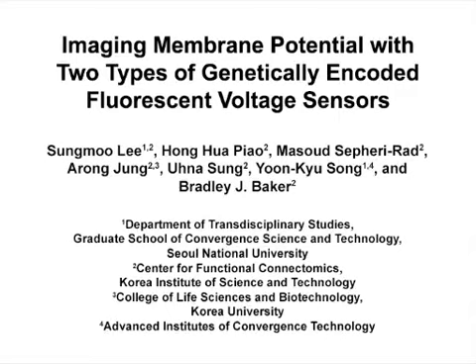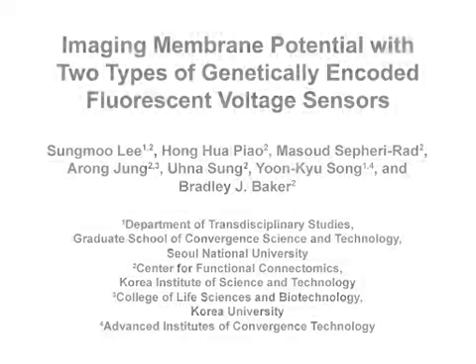The overall goal of this procedure is to optically report the membrane potential changes with a genetically encoded voltage indicator. This method will describe the strengths and weaknesses of imaging with different genetically encoded fluorescent probes of voltage. For instance, FRET-based probes will offer the advantage of ratiometric imaging, but will give a lower signal.